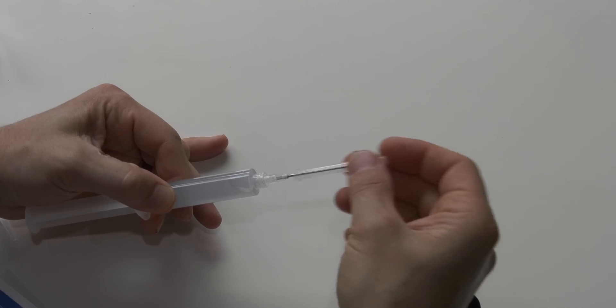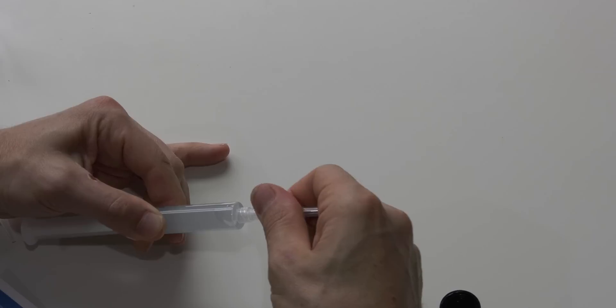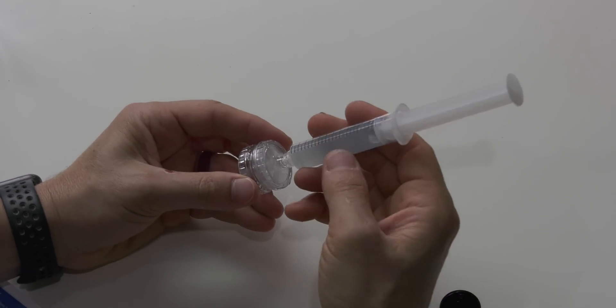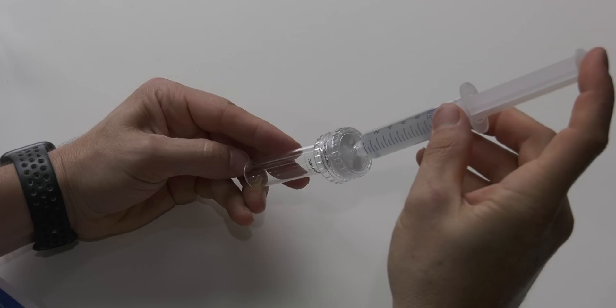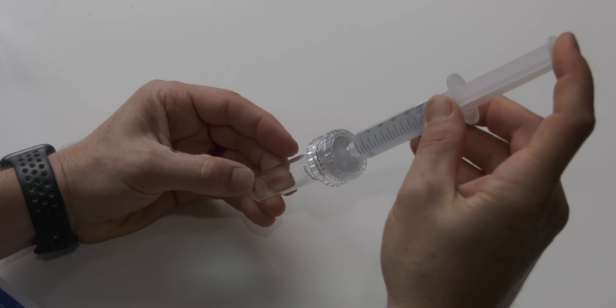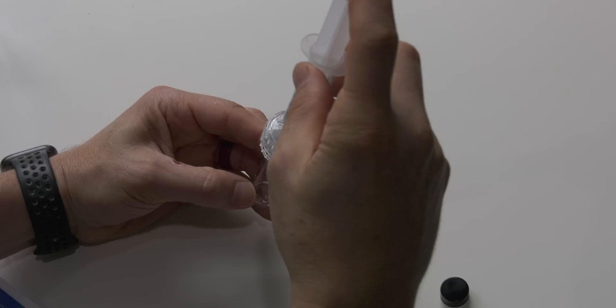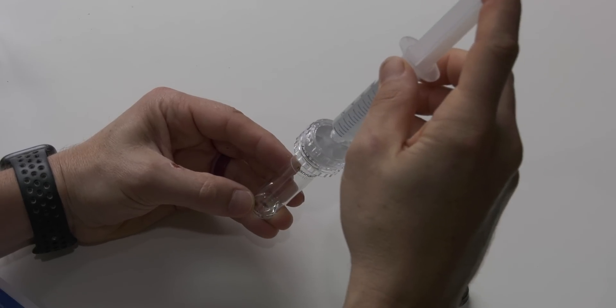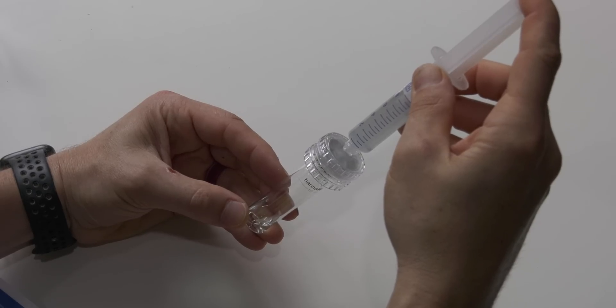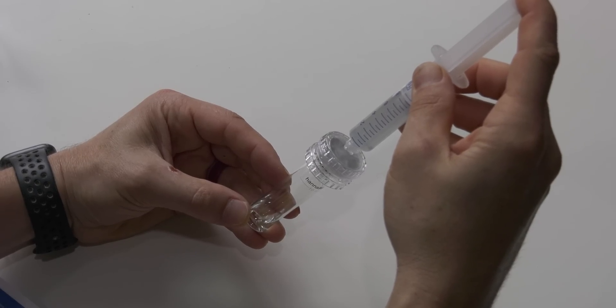Then replace the needle cover and twist to remove it. Next, attach the filter assembly to the 10 milliliter syringe. Then hold the filter and syringe over the supplied cuvette and slowly push the plunger until you fill the cuvette up to the 10 milliliter mark. It's much nicer to slowly dispense water from the syringe than trying to dip it into your tank and get exactly 10 milliliters.